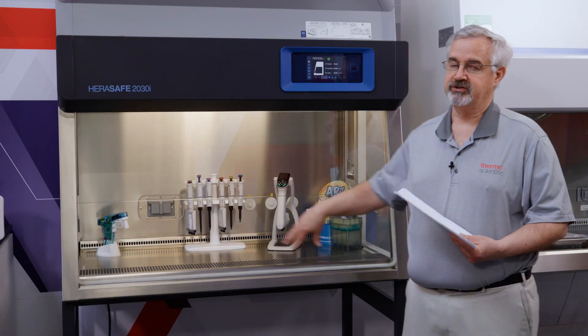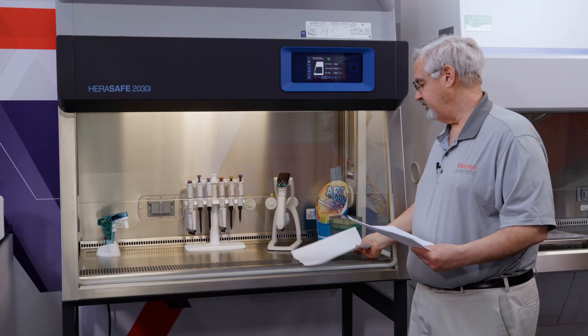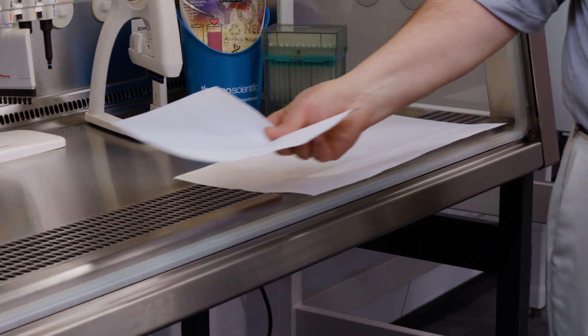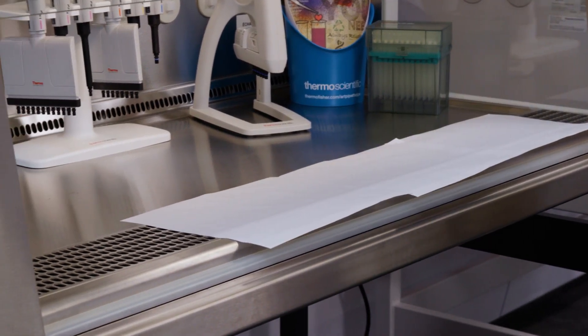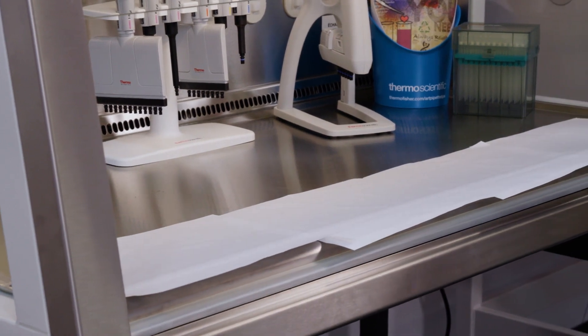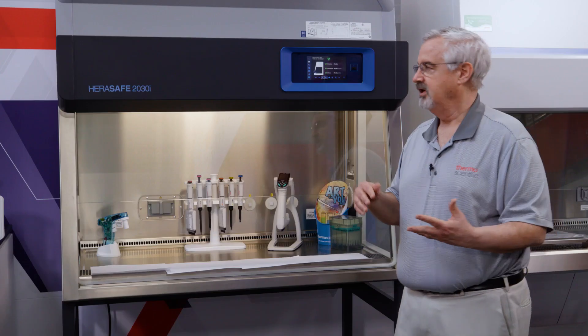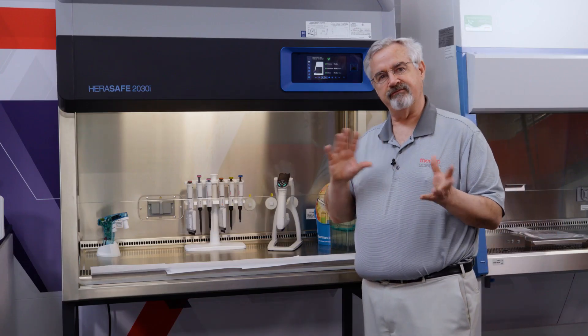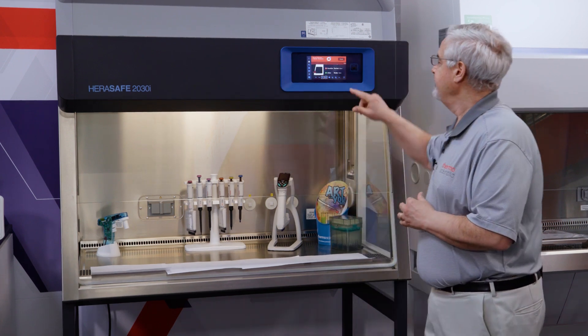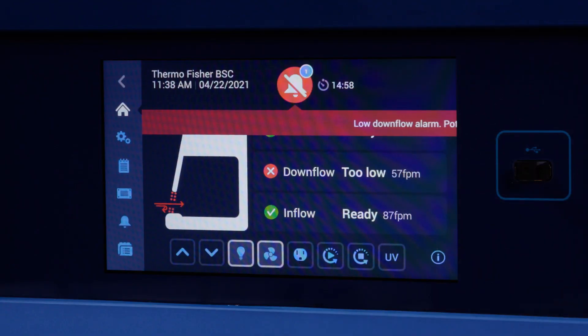With the touchscreen, we're able to have full-text error messaging and alert messaging. Let me show you what that means. I'm going to really disrupt the airflow by blocking essentially the entire front of the grill. When the alarm goes off — because we're doing such relatively catastrophic things — a lot of alarms will happen. You'll see with every different alarm the alarm will resound even after I snooze. I'm going to hit snooze to silence the audible part; the visual alarm is still signaling.